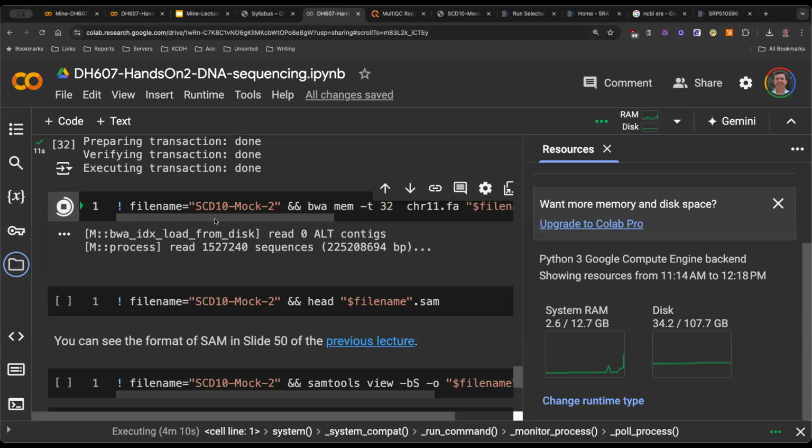What happened? Copies. Copies what? What platform are you using?